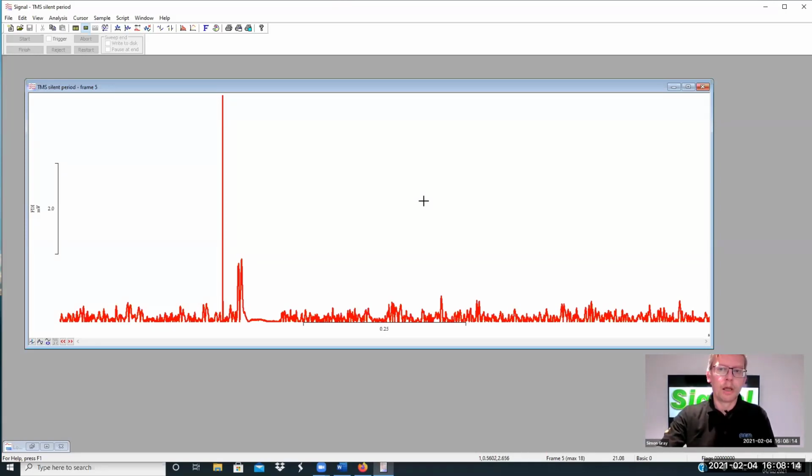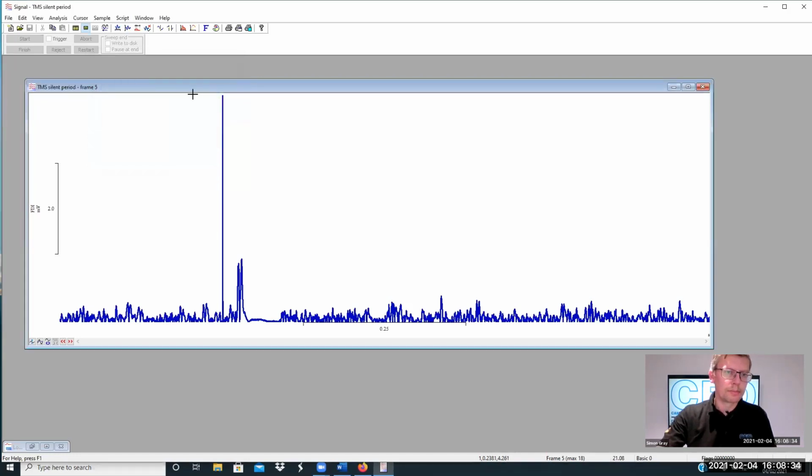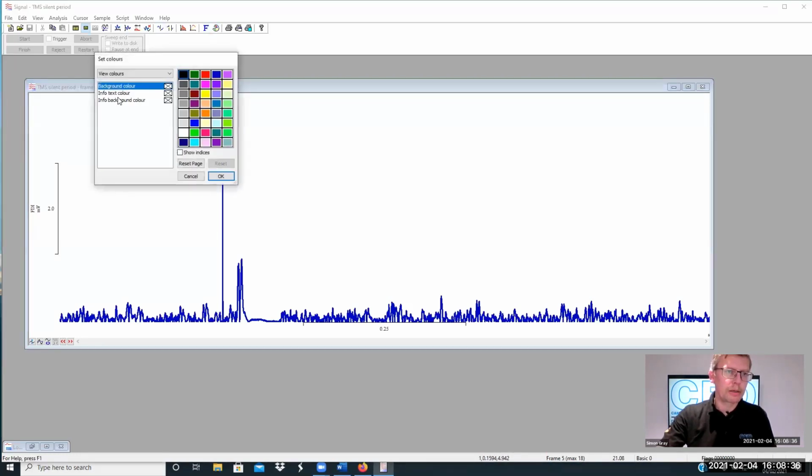Okay. Now, we could go further. We could set up a channel primary color. Let's go for a blue this time. And you might notice a secondary color, maybe fairly garish here, like so. Let's get that back. Channel background color, minus reading. There we go. All right, I'll reset that actually.